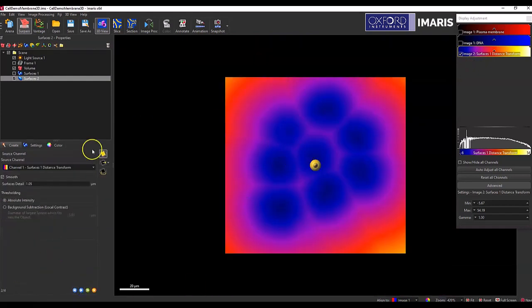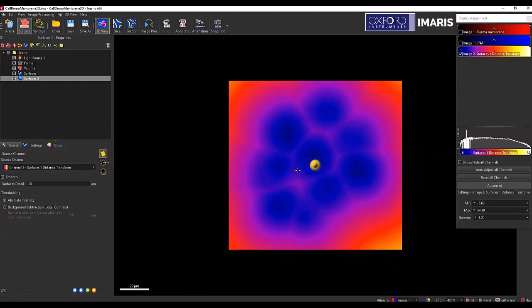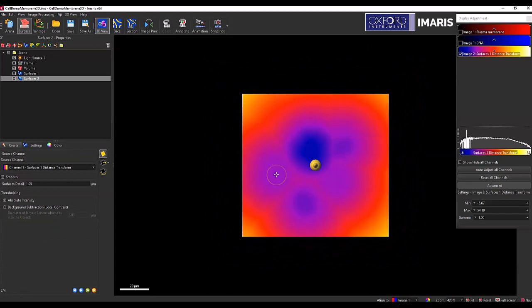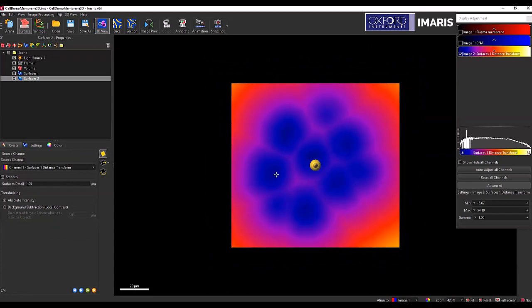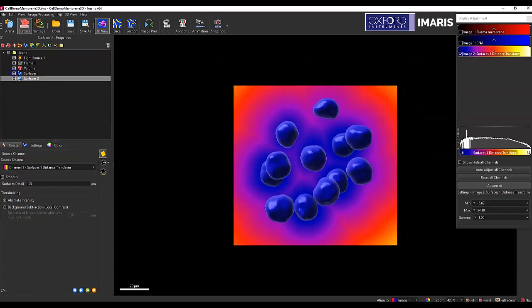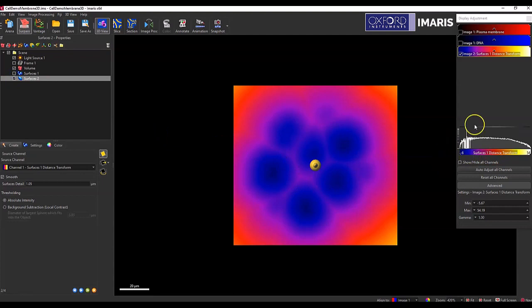And then I'm in the slicer rendering mode, as you can see, as I move through the Z stack, the areas inside where my original surfaces are will be colored black, meaning that they're inside where that distance transformation channel was created.